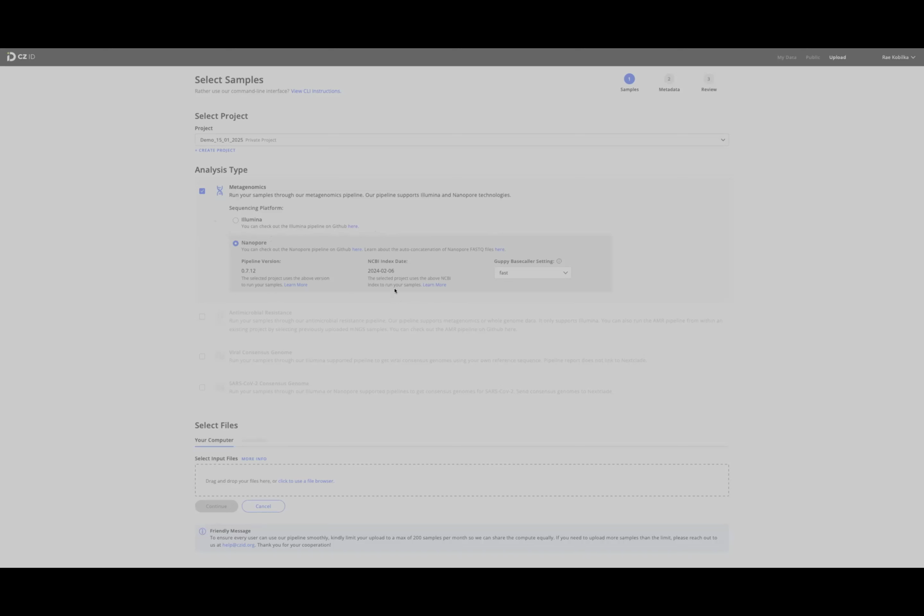from your Nanopore sequencing device, you get the different folders. The most important ones are the ones with the FASTQ pass files. And like I said before, your samples are barcoded. So each sample has one barcode, and we will just focus on one sample. So we just go to barcode 1 and we select all of the files, a bit quickly, like this. And then you upload it.